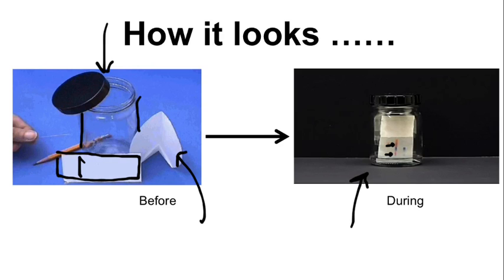Okay, no, why not? They traveled different distances, which means their polarity was different. If their polarity is different, they're also likely different compounds. Well, how about that pink spot, our first one, versus, say, this spot right here in the middle, the blue spot? Could those be the same compound?